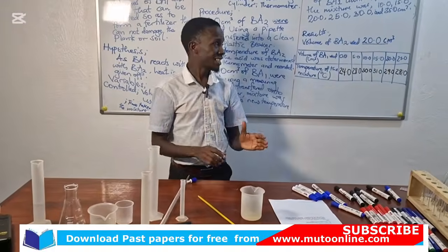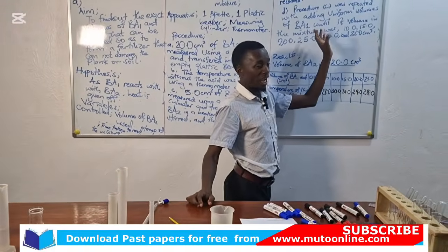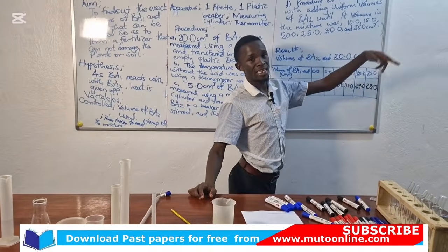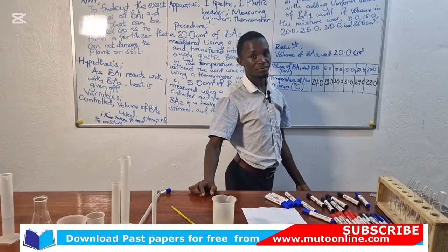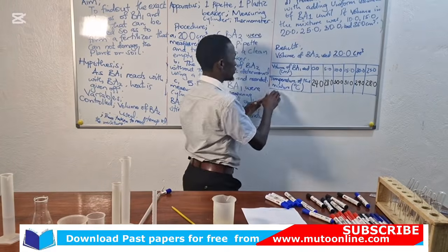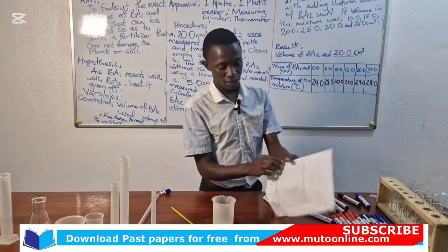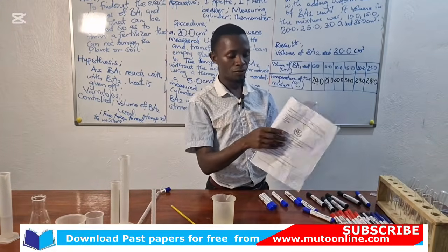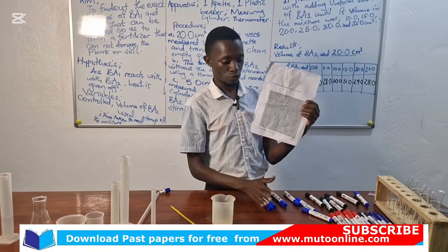So we are adding this uniform volume of the acid at intervals, stirring, recording the temperature. The values we obtain, we shall write down, like in this paper, where we are given space for a graph page, a squared page.